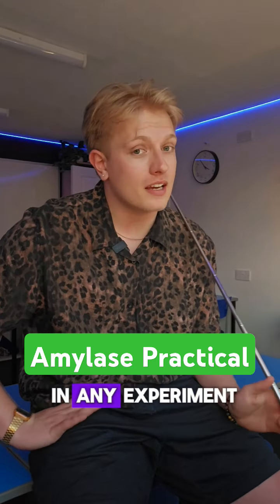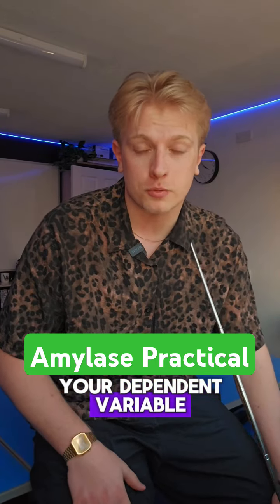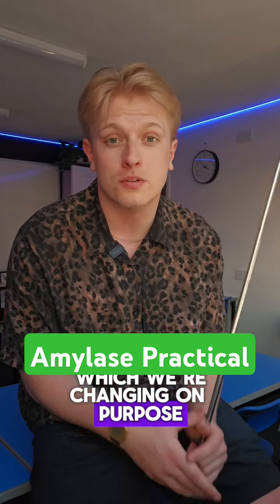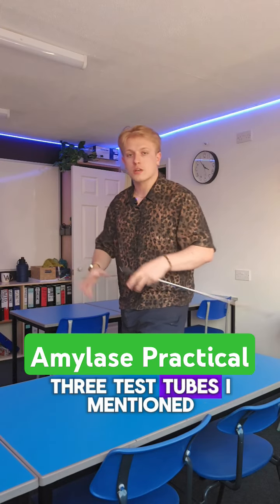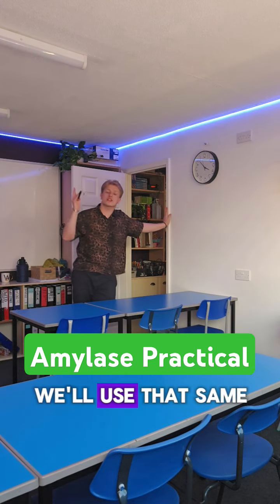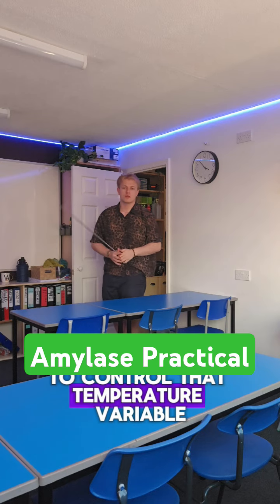Now bear in mind, in any experiment you have to control everything else that could also affect your dependent variable, which in our case is the activity of the enzyme amylase. So the things that could also affect that enzyme activity other than the pH, which we're changing on purpose, include temperature for certain. So our next step is to take those 3 test tubes I mentioned and put them into a hot water bath to allow them to equilibrate and basically reach the same temperature. We'll use that same temperature for every single pH that we test to control that temperature variable.